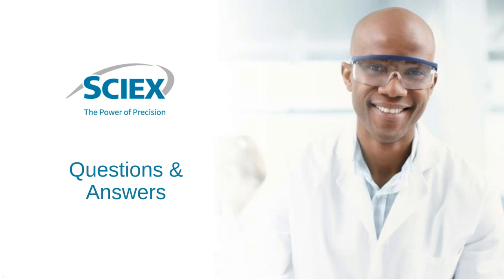New kits and new workflows will be gradually added onto the platform as validated kits. Right now it's not yet a validated kit, but as I said, we have the 20 to 30 centimeter cartridge available. So if your particular method is using that cartridge, there's nothing stopping you from testing it on it. I hope that answers the question.